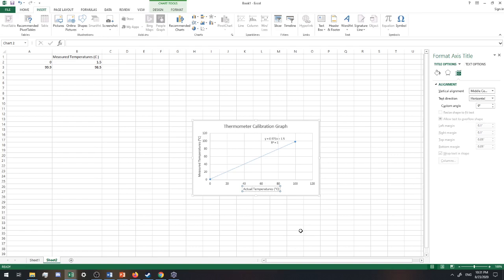But another way to think about it is that the x-axis here is going to be the real temperature our system was at, whereas the measured temperatures on the y-axis are what my thermometer is telling me it is. So you may have to make some adjustments, or maybe your thermometer is perfectly calibrated, and it'll come out exactly the same. You'll just use this equation by plugging in your measured temperature for the y, and then solve this equation for x.